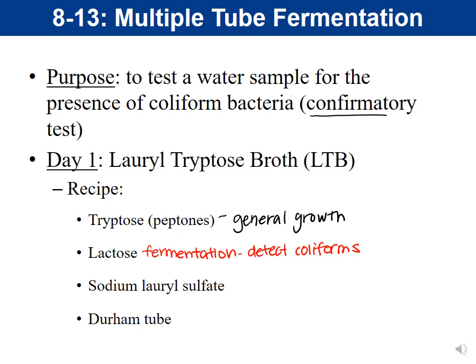So the lactose, again, is going to be the substrate that's going to allow us to detect coliforms. Now, the next ingredient in the media is sodium lauryl sulfate. You might see sodium lauryl sulfate in shampoos as an ingredient.